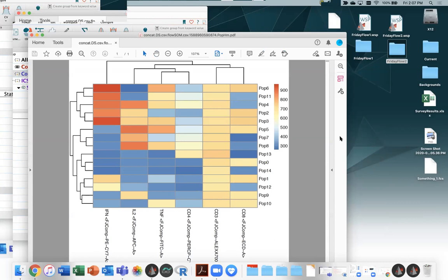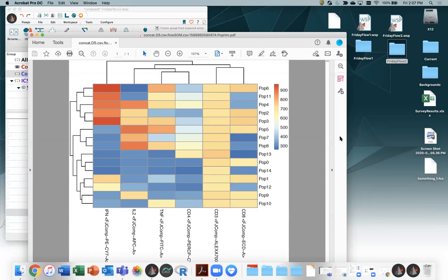From Sarah: what troubleshooting can you do if dimension reduction algorithms do not separate well geographically? I saw this recently in mass cytometry with 20 plus surface markers and 500,000 plus events in the file. So, separate well geographically, let me think, what would we mean by that? That you tend to get more of just a tight pack of cells in the center of the screen, for example, as opposed to well separated islands. That's my interpretation of separate well geographically as opposed to phenotypically, whereas the things that we could manually gate and compare look like they're well separated. Is that about right, Sarah?